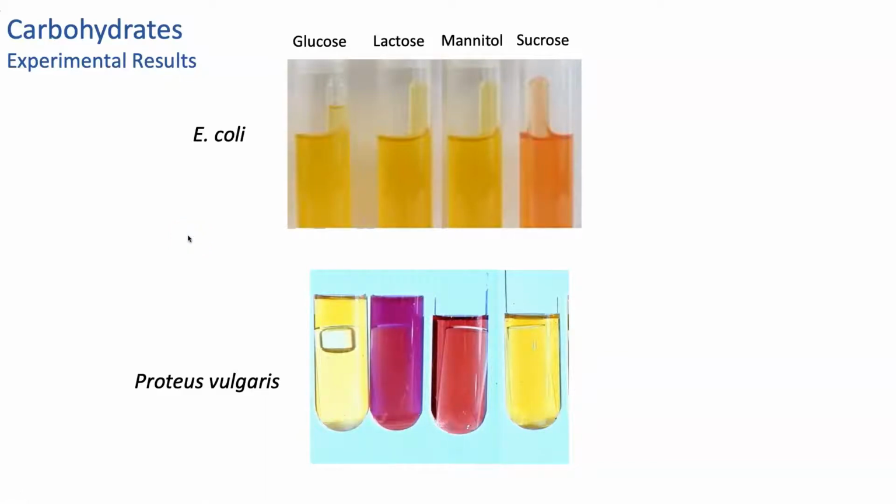Take a look at that. What do you notice? Well, yeah, you notice that it is yellow. What else do you notice? Look at that. Do you see that gas bubble at the top? So what would that tell you about their experimental results? That's right, Ag. Remember that that's how we document a positive reaction: acid plus gas.